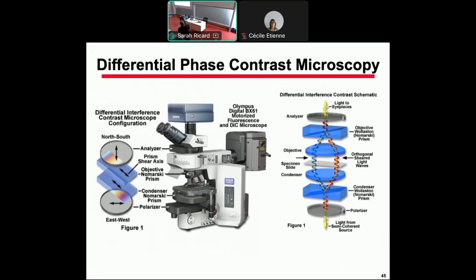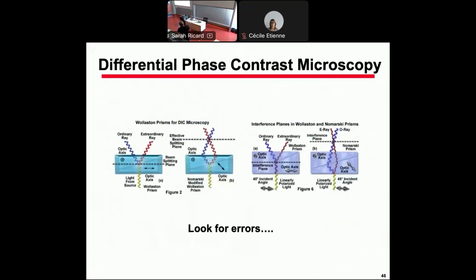You see here, light is separated and perfectly white. All the images I took off the website, I will give the references again. It's not because it's on a website, even the manufacturer's website, that you will not find very strange things. For example, these are the drawings they gave for the image formation.